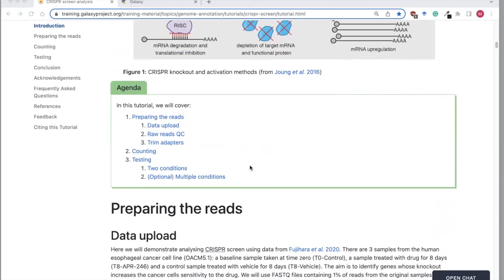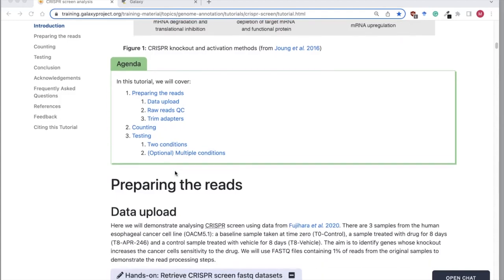Today what we're going to cover is: we'll upload some data, some FASTQ files of raw reads, and we'll check these raw reads for quality. We'll trim adapter sequences, and then we will count the guides we have, and then we will test for differential abundance of guides across two conditions — a treatment and a control.